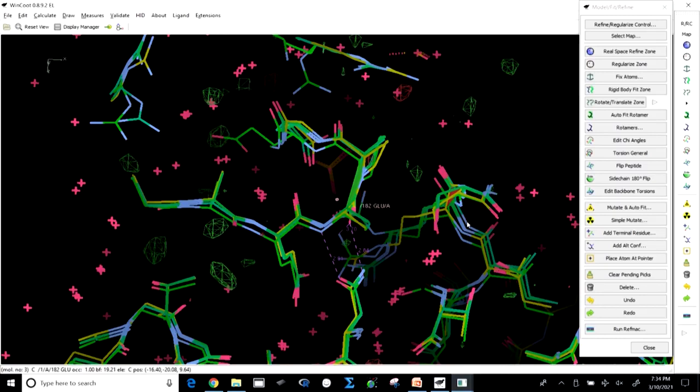But even if you do not have your own data, you could download the MTZ file, you could download the electron density map from crystallography, you could download the electron density map from electron microscopy and practice this part, the computational part, which is an integrated part of structure development, and only software platforms like Coot could give you. As I told, there are other ones, but at this moment it is Coot which is used by the entire community.